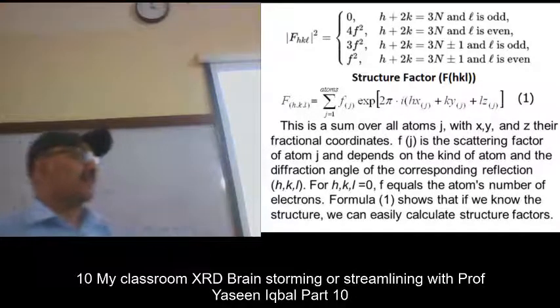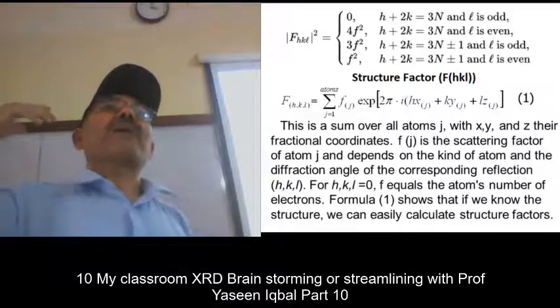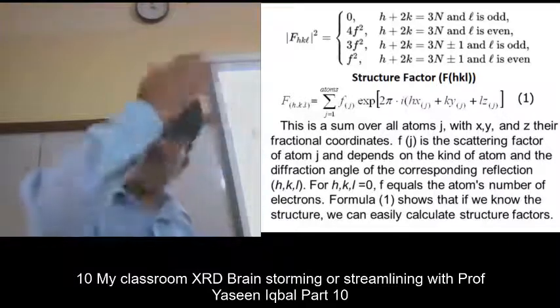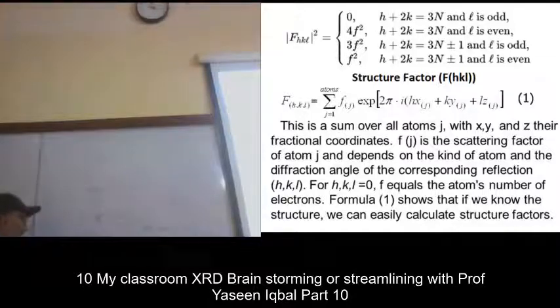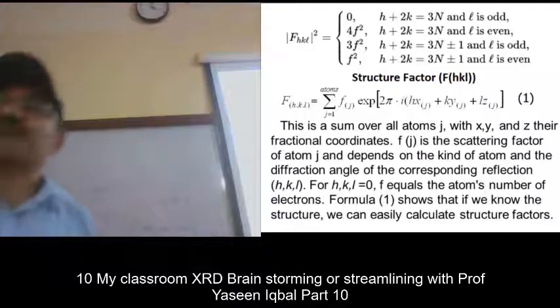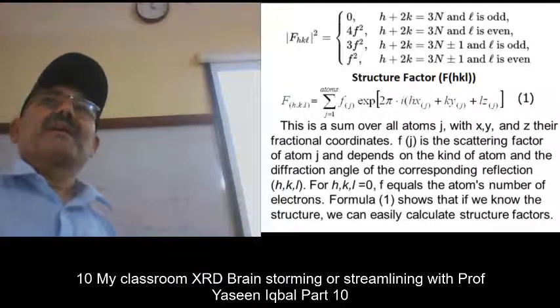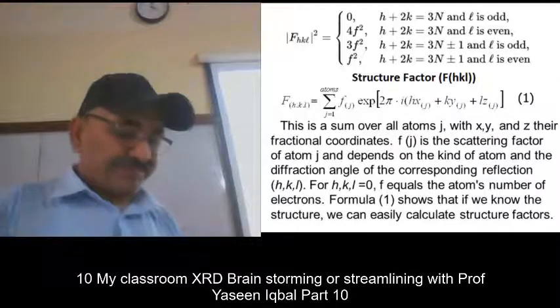So the structure factor dictates whether a particular reflection will be there or not. And if it is there, for example in electron diffraction, an electron is scattered from here, but scattered from somewhere else and gives you intensity here, which is not expected, then people call it double diffraction, which is unusual, but it happens.